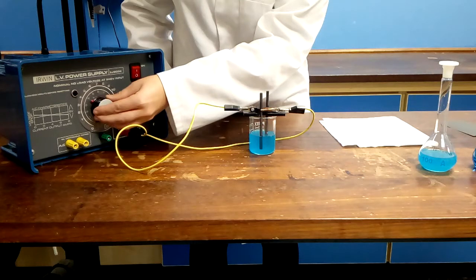Chlorine gas is produced during this experiment. This is toxic, and so for safety reasons you will need to make sure you are working in a well-ventilated room and that you do not have the power pack switched on for more than 5 minutes for each salt solution.